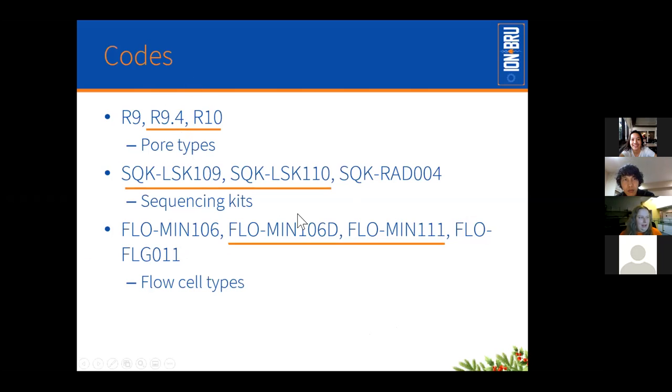You're basically going to be using one of these kits, one of these pores and flow cells and kits, and these are the most accurate ones. But I think for the protocol we're talking about today, you're probably going to be using the 9.4s, the 109 kits, and the flow cells that use the R9.4s.